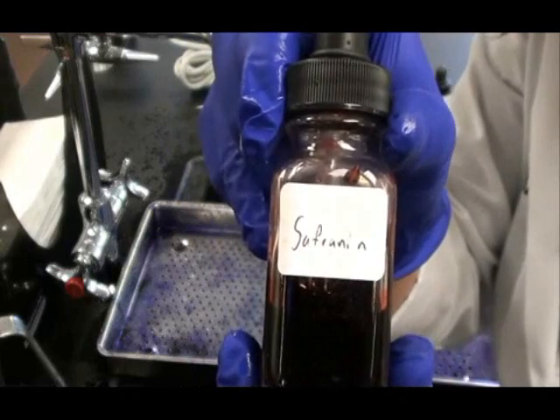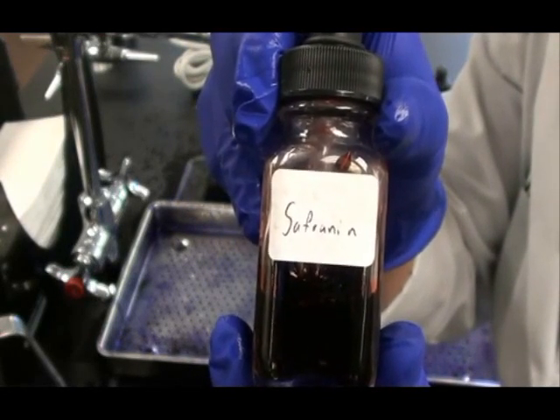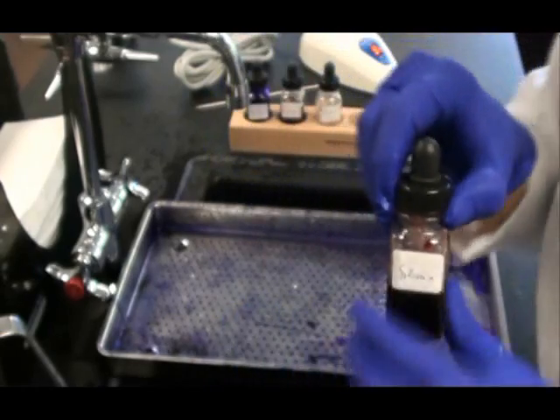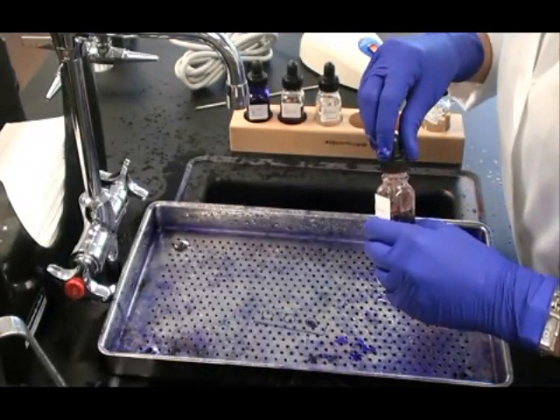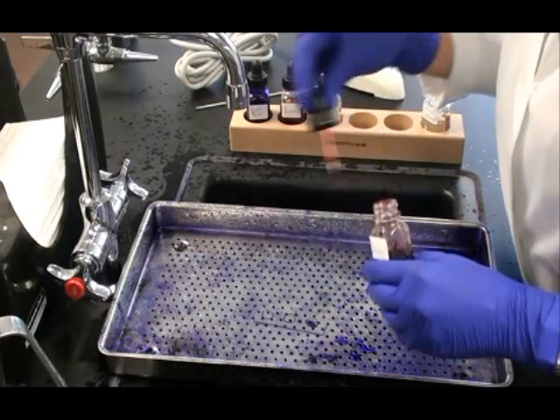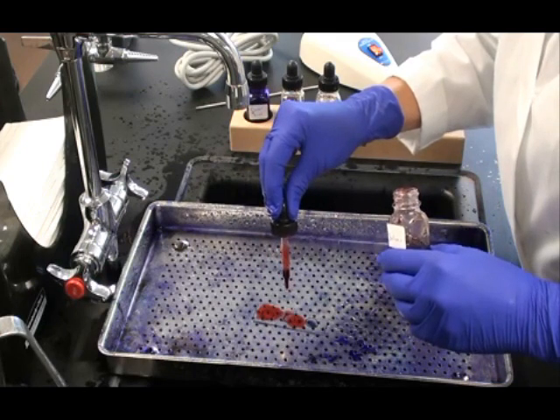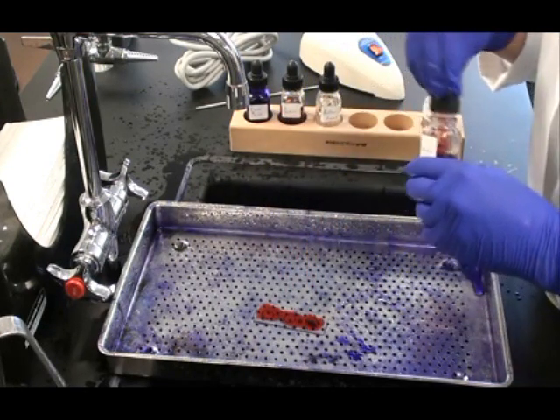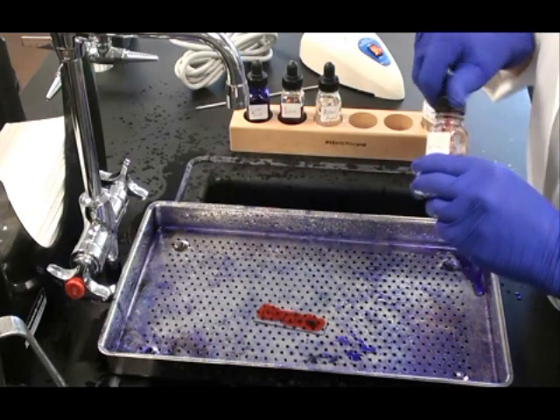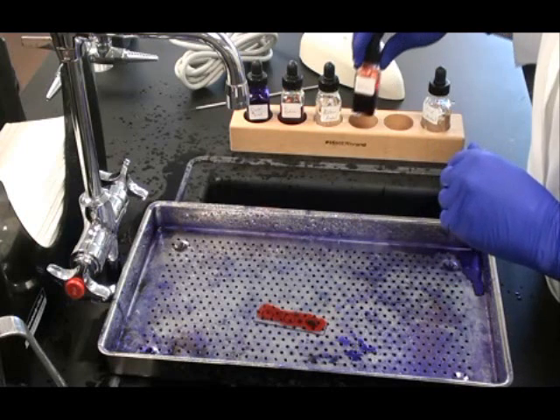We use Safranin as a counter stain because it's pink in contrast to the purple crystal violet. I let the drops of Safranin fall onto the slide. Making sure I cover all three bacterial smears. And then I wait for one minute.